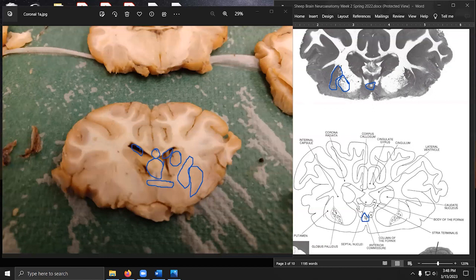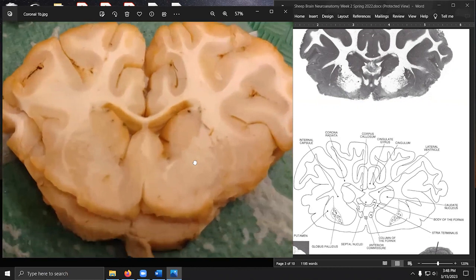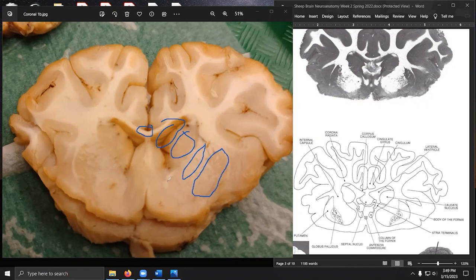Now, to do a quick comparison versus other similar sections, we got another one here. So here we could kind of zoom in and take a closer look. Here we do have some different features we can look at. First, we have again corpus callosum, lateral ventricles, caudate, internal capsule. You might be able to distinguish globus pallidus from putamen here. They're both collectively right over here. We do have what appears to be column of the fornix, this sort of white dash mark kind of here. Septal nuclei, like I mentioned, are here. And I think that's about it for what I care about with this section here.